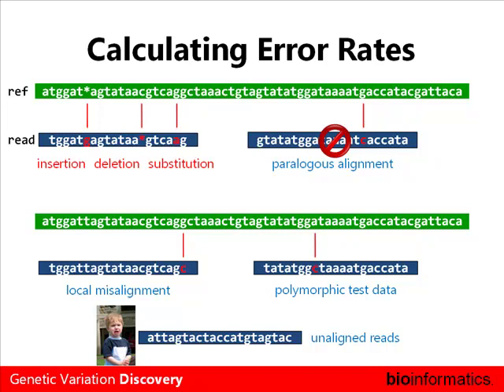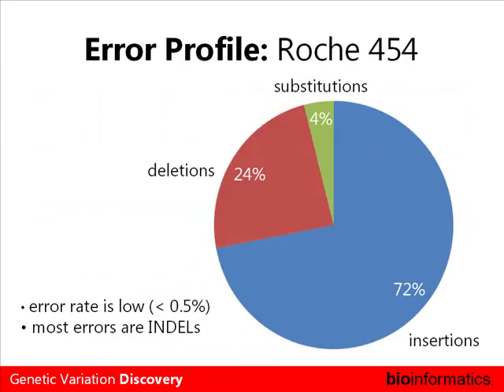And then the question is, okay, if you're aligning all these reads, what about all those reads that didn't align? So that's a very unhappy kid there. And this horribly skews how you think of the error rates. If you pick very stringent alignment criteria, then maybe only the best reads align, and then you'll think, wow, we have a 0.1% error rate in the sequencing technology, whereas you probably have 4%. So these are the caveats involved, but I was going to show you some of the results.